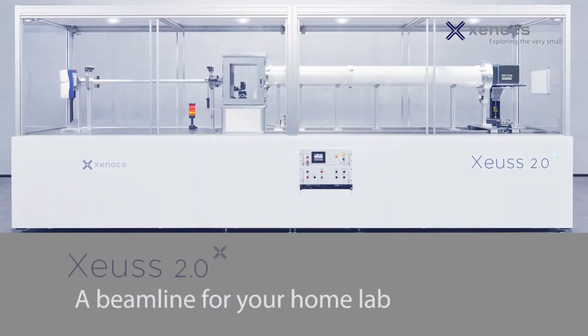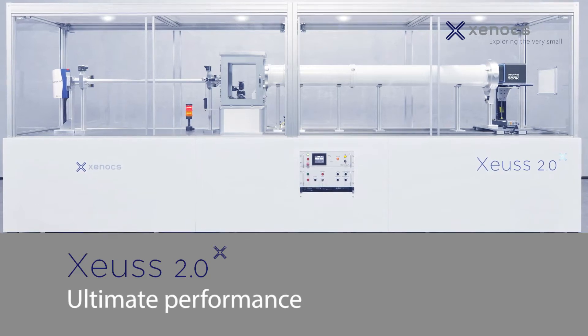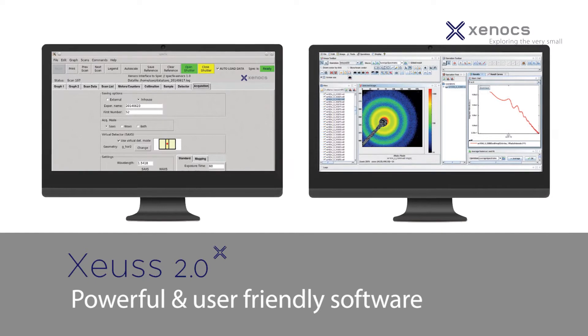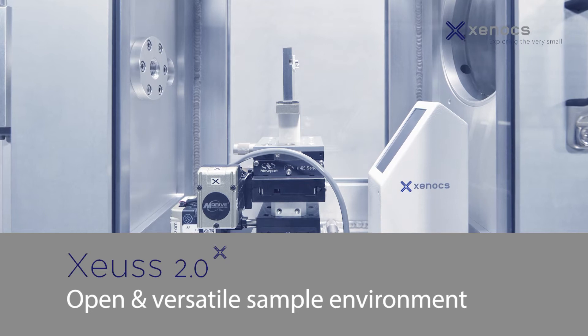The XEUSS 2.0 was designed as a beamline for your own lab and combines full flexibility and ergonomics. It is an open system, adaptable and upgradable to meet the needs of your application and experimental environment.